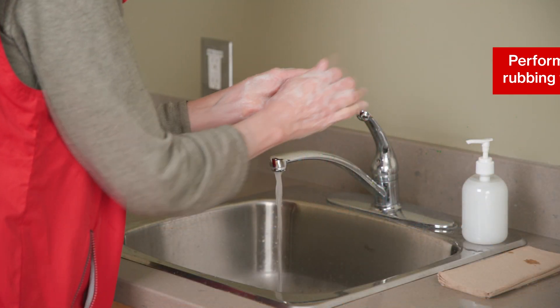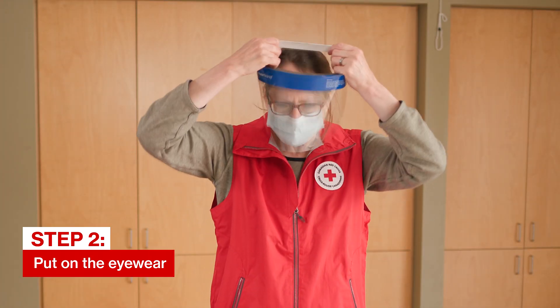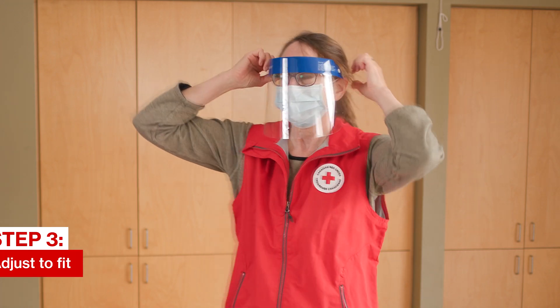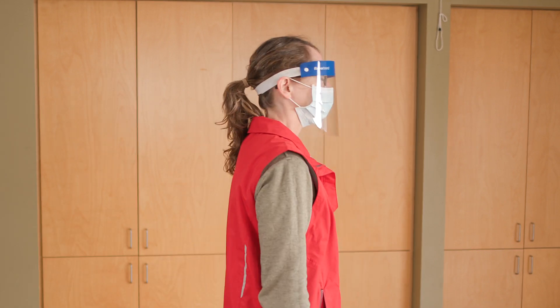First, perform hand hygiene with soap and water or an alcohol-based hand rub. Place the eyewear over your face and eyes, or eyeglasses. Ensure the fit is snug by adjusting the straps. Replace the eyewear if it becomes scratched or compromised.